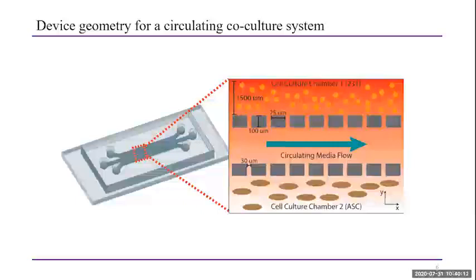The goal of this work is to develop a microfluidic device capable of simultaneous co-culture of 2 different cell types that allows for the collection of the excreted biomolecules that cancer cells use to communicate with other cells. In using microfluidics, we are taking these complex, expensive processes and making them into scaled natural processes.